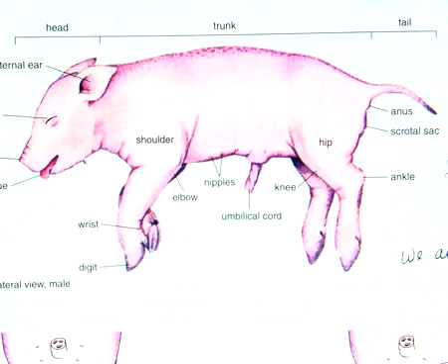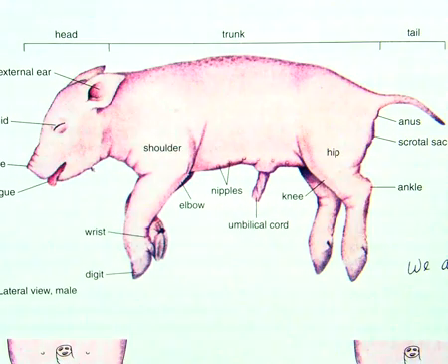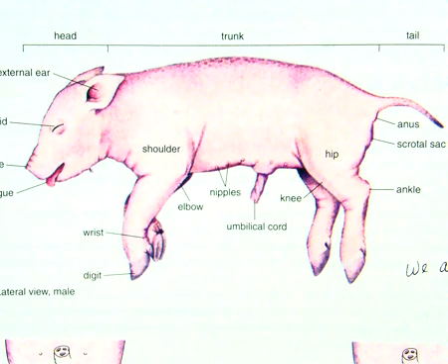Though it is imperative in the study of biology that we do understand all organisms, and you've gotten a great overview through this course. Nothing very deep, but definitely broad in all the different organisms. So here in this last lab, we're just going to focus on this class Mammalia and use this representative, the fetal pig. I've got a couple here, but I just want to look through page 371 in the book, and I loaded the PDF of this exercise yesterday.